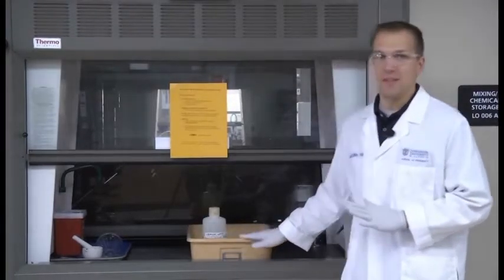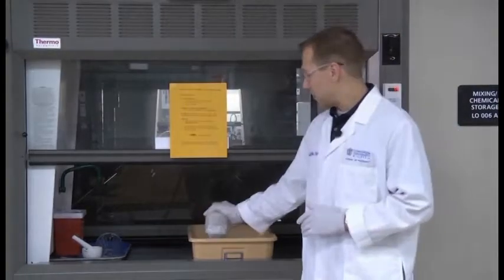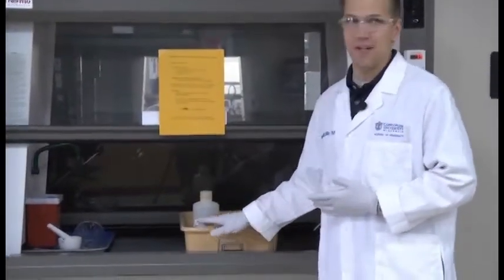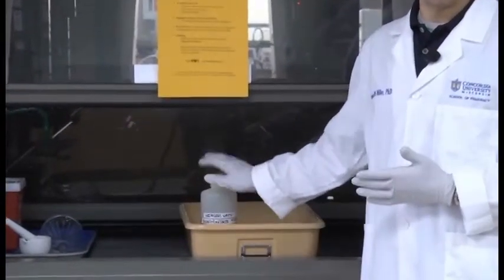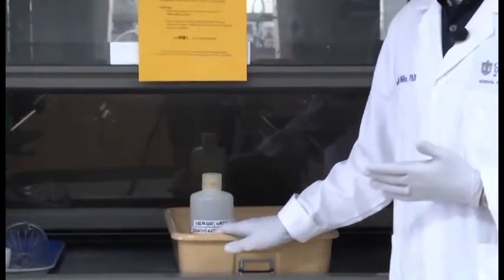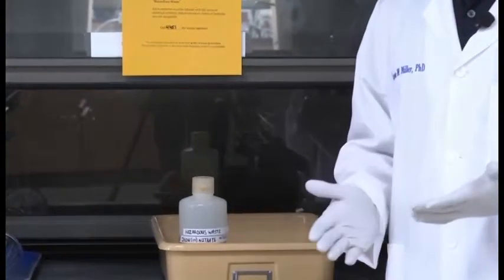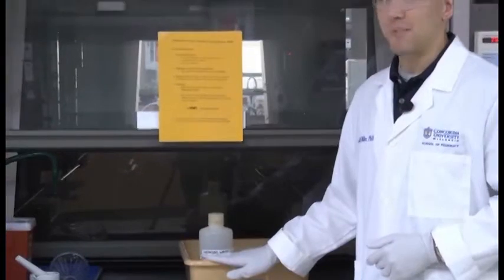Another important thing in this waste accumulation area is a secondary container. So I have my primary container that's containing my waste. There's also this bin, which is a secondary container. And this is there in case I do have any leaks of my waste container. This will catch those leaks, prevent them from going into the drain, and prevent them from escaping to the environment. So another important thing that should be in all of these satellite accumulation areas is secondary containment.